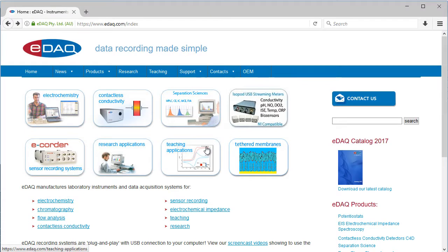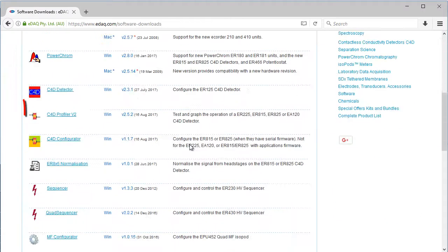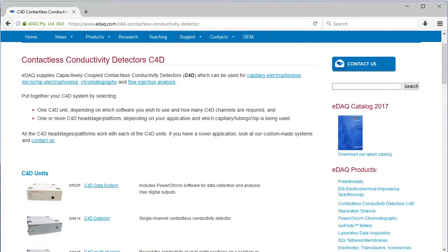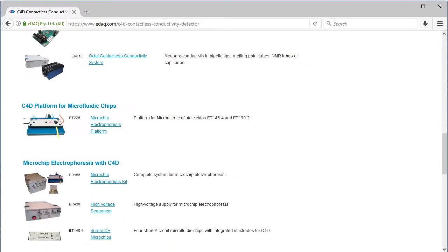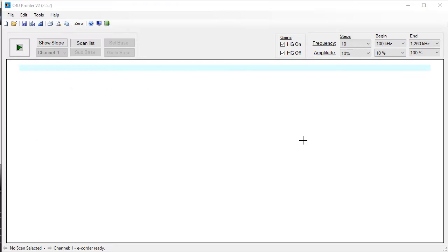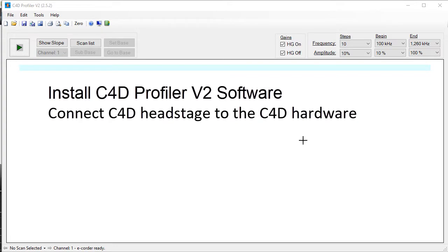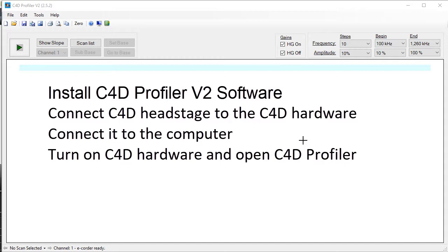You should download the software from the EDACC website, in Support Software Downloads — it's here. The C4D profiler software works with all of the C4D units and all of the head stages and platforms. When you have installed the C4D profiler software, you should connect the C4D head stage to the C4D hardware and connect it to the computer. When you turn on the C4D hardware and open the C4D profiler, you should see something like this.